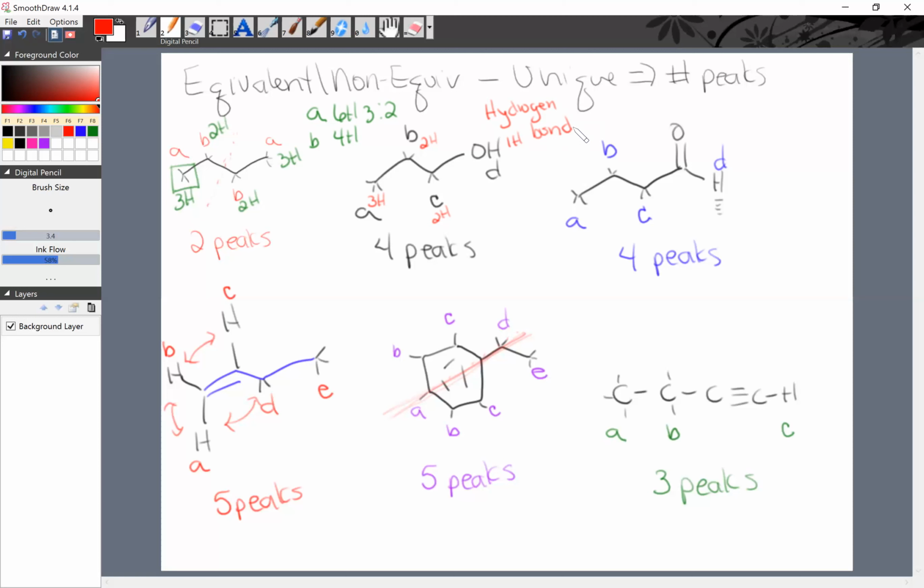All right, so over here, 3 hydrogens, 2 hydrogens, 2 hydrogens. Don't forget that aldehyde has a hydrogen. So a 3 to 2 to 2 to 1 relationship again. Wow, I'm very boring. Okay, now down here, though, what color haven't we used? We'll go pink. This one, so C will integrate for 1 hydrogen. This one will integrate for 1 hydrogen, 1 hydrogen, 2 hydrogens, and 3 hydrogens.